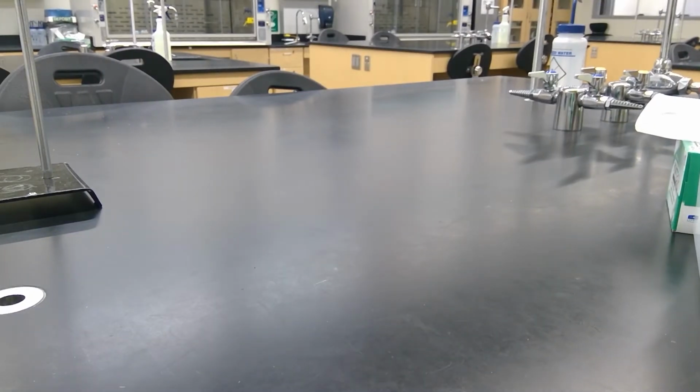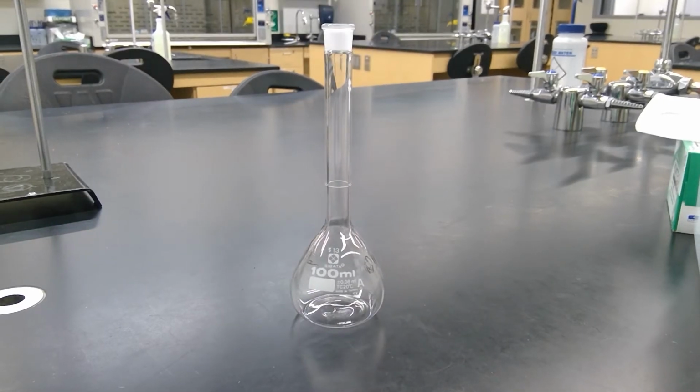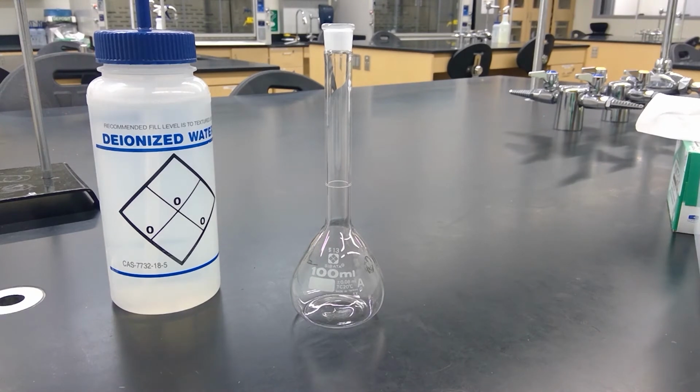a 100 ml volumetric flask, which looks like this. And you'll want some deionized water. It says to put approximately 50 mils of distilled water into a 100 ml volumetric flask.